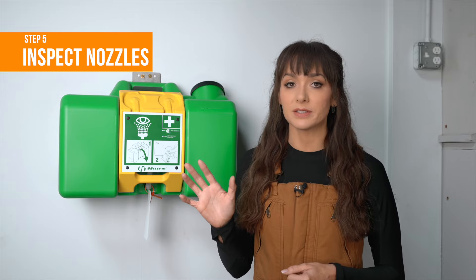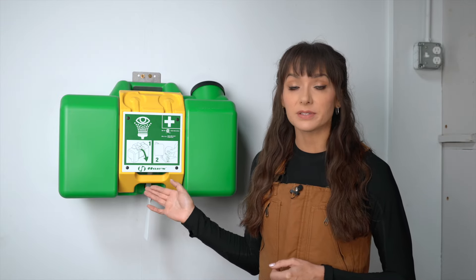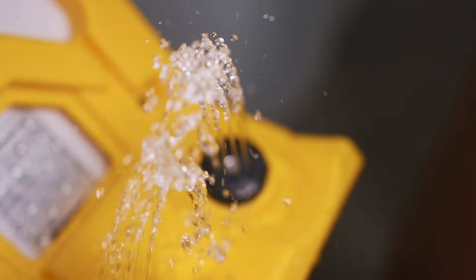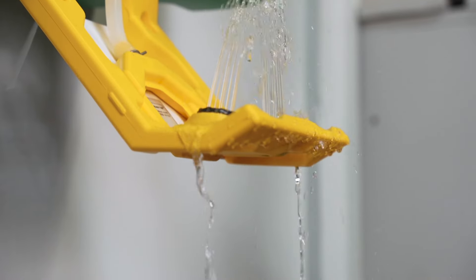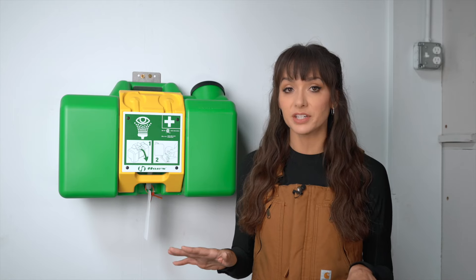Step 5: inspect the nozzles. This particular unit will activate if we look at the nozzles, so if you can activate in your situation, check the nozzles for cleanliness and proper function. The nozzles should be covered when not in use to prevent contamination. Clean the nozzles if necessary.